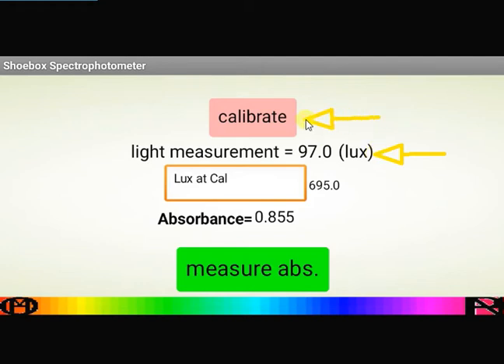This calibrate button that you press, as you saw in the previous video, when you put your blank in will store the light measurement at that point. And it also displays it here.